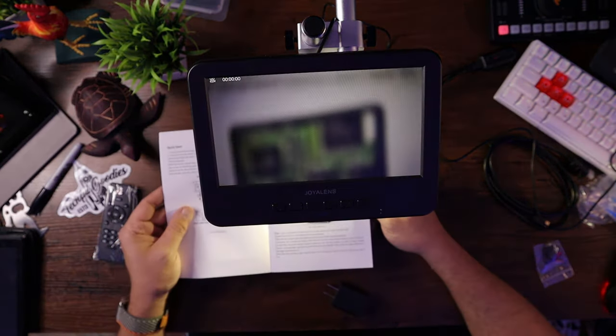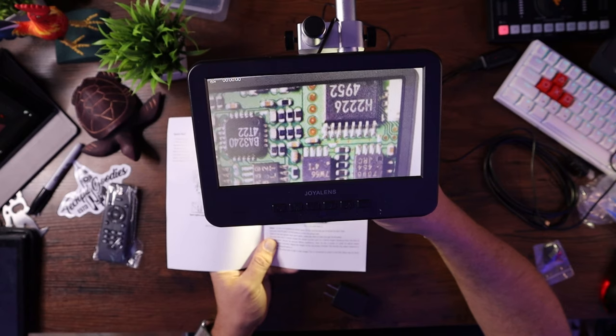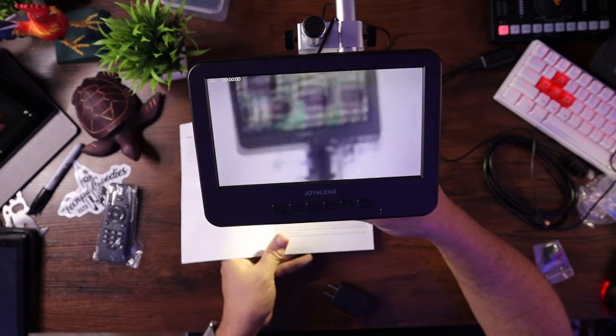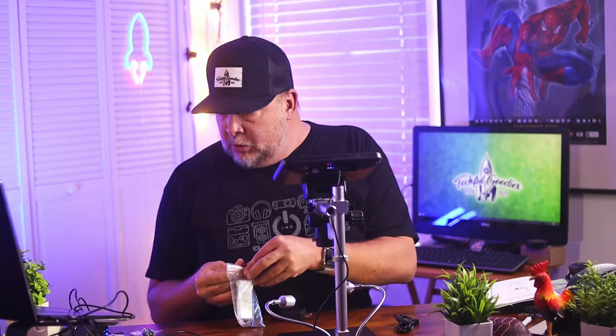There might be a little LED flashing from the camera refresh rate. Let's go ahead and try some different things. Put this under here — it's not autofocus. There is a focusing ring on the side so we can focus directly on the item we want to see. They also gave us a couple of slides to look at, which the kids will like for school. And they give you a little light box that lets you put a slide in and light it up from underneath so you can see it directly.